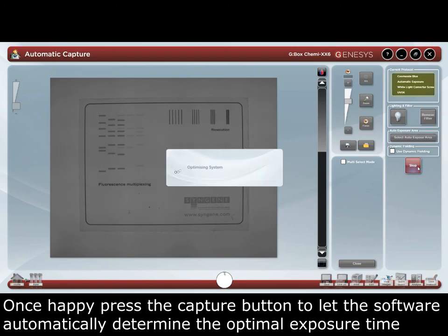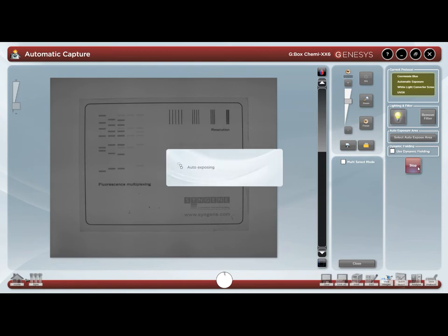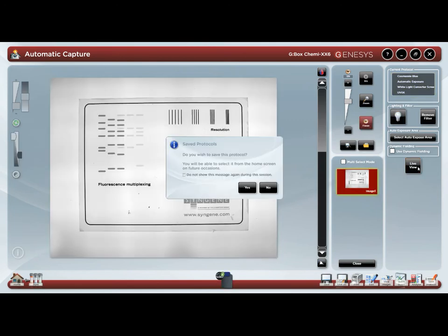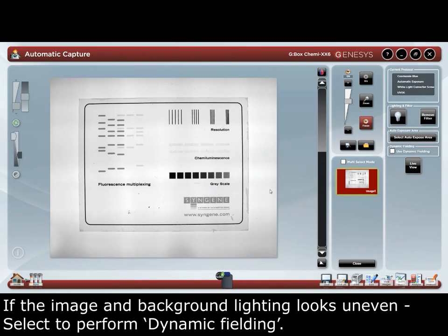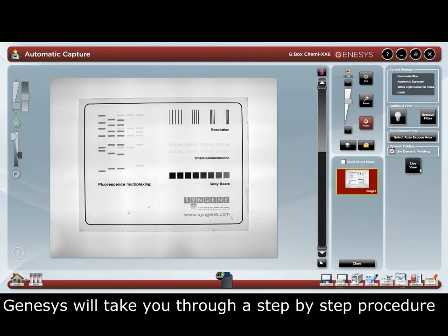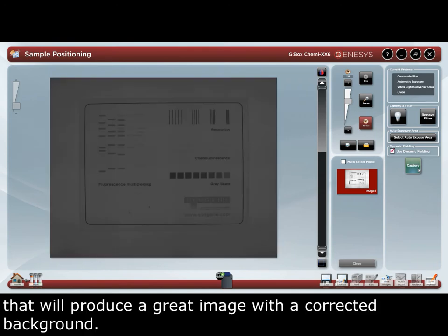This lets the software automatically determine the optimal exposure time without ever saturating your image. If the image background lighting looks uneven, select to perform dynamic fielding. Dynamic fielding is used to correct for any uneven light. Genesys will take you through a step-by-step procedure that will produce a great image with a corrected background.